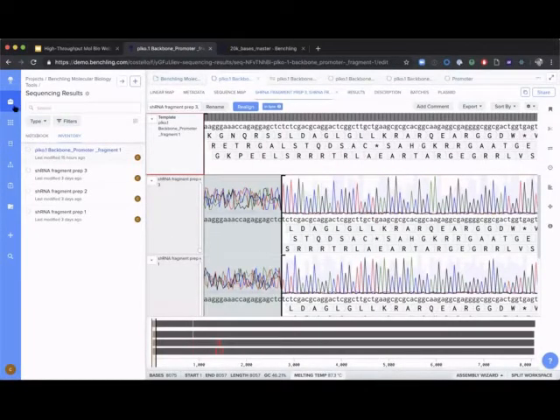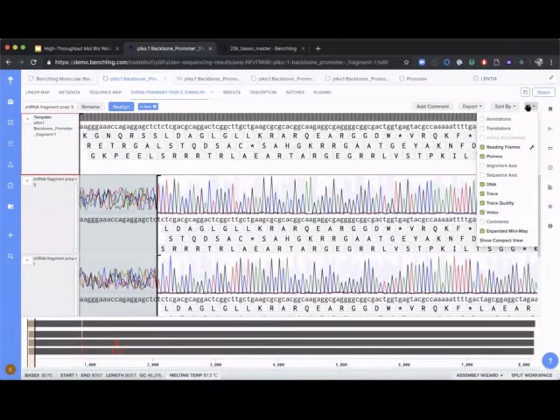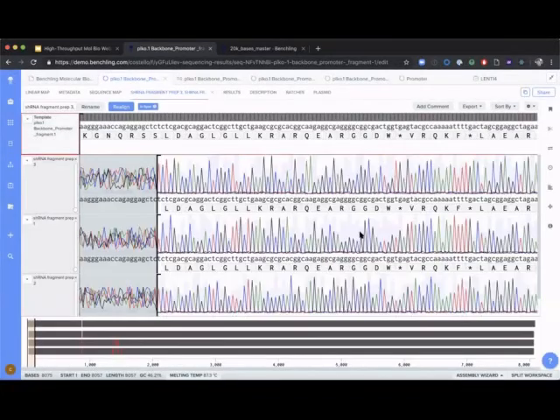So you'll see here that we've now created one of our alignments, and you might notice that there's a lot going on here. This is because our alignment tool offers an abundance of very interesting, unique display features, all of which can be toggled via display icon, similar to when you're viewing a sequence map itself. I can look at specific reading frames. For example, I only want to look at one reading frame.